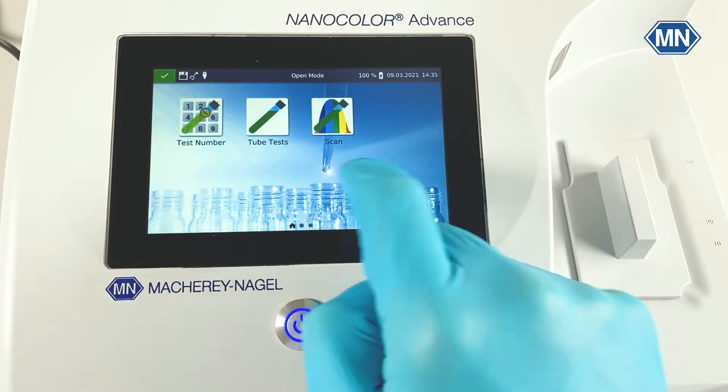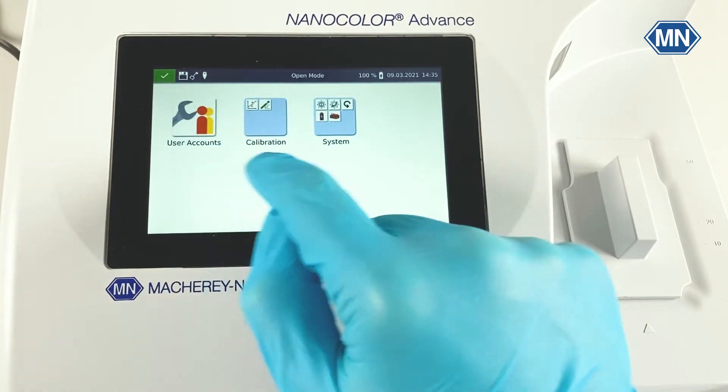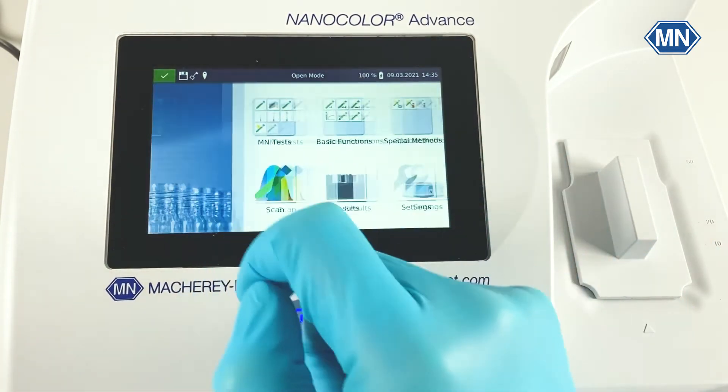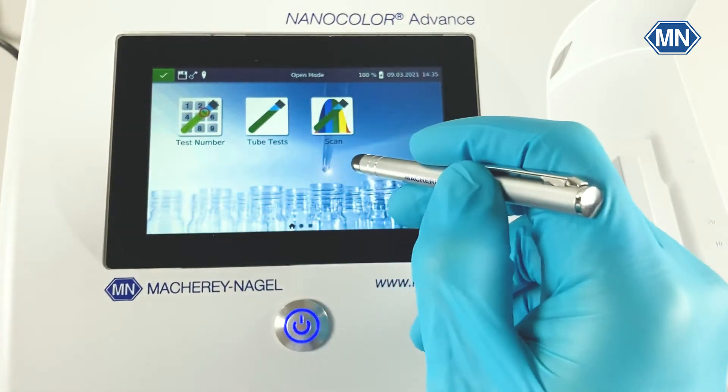Once the start-up procedure is complete, it's best to get used to the photometer and the touch screen itself. As you can see, it can be controlled like a smartphone or tablet with your fingertips, with or without gloves, or for example, also with a touch pen like this.